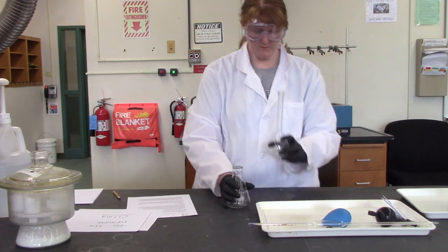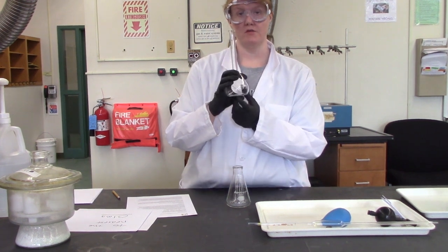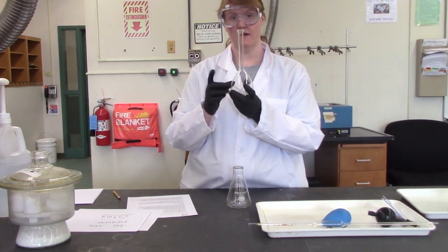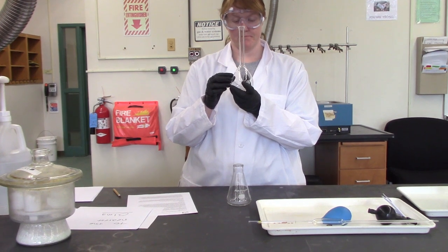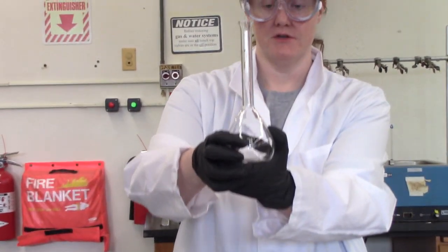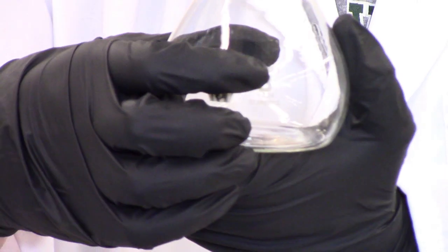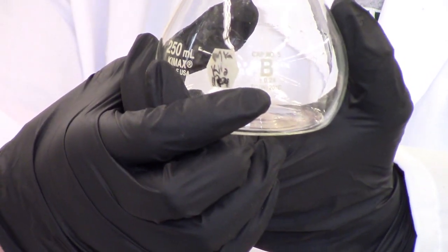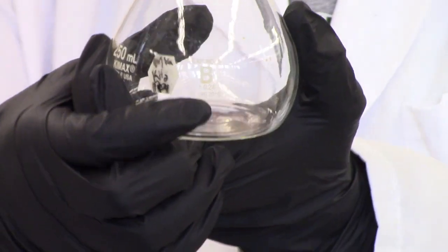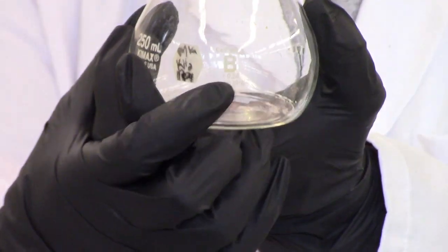Then you'll take your 250 ml volumetric flask, okay? These are class B glassware. See if you can zoom in on this and see what it says right on the jar. It says 250 class B, and it tells us plus or minus a tolerance down here and a temperature. It says to contain, TC.